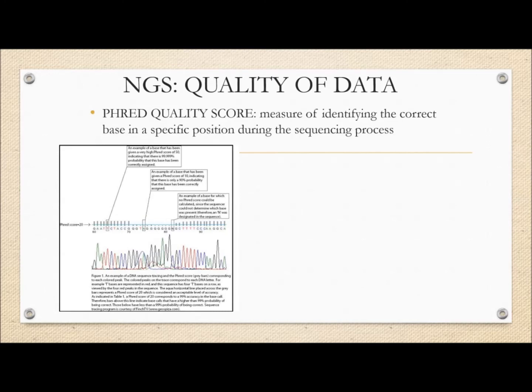So remember, these nucleotides are being added one on top of the other. So let's say you added 40 of these. Somewhere between 10 and 25, something happened, and the probability of the right one is pretty low. So you might say, well, yeah, this is green, but it looks like the T probability is quite high. And then as you go on, the green probability of it being an A is pretty high again. So it looks like somewhere in the middle of the experiment the quality became low. Once again, if it's at this green line, it's 20. If it's way above, it's pretty high.